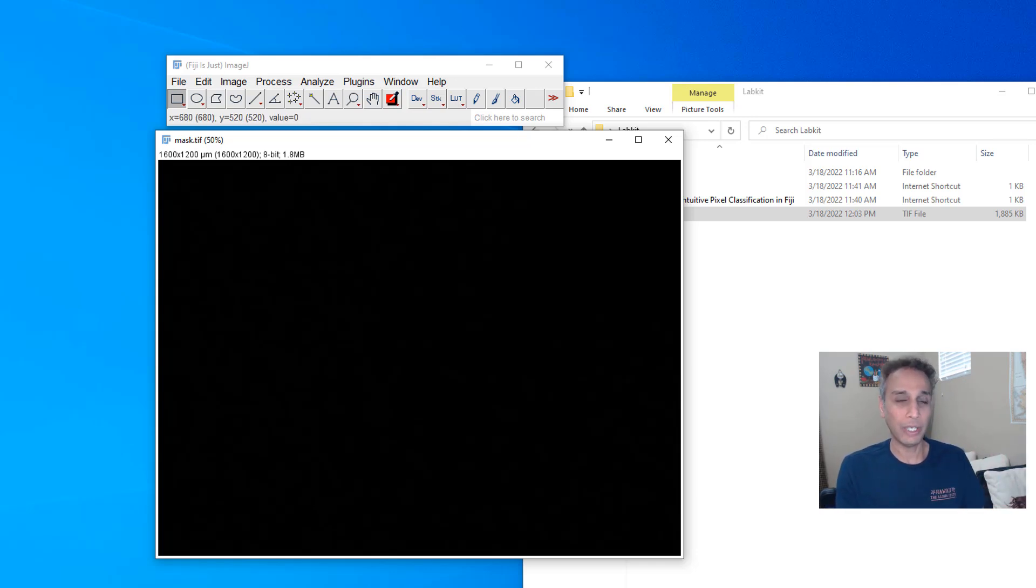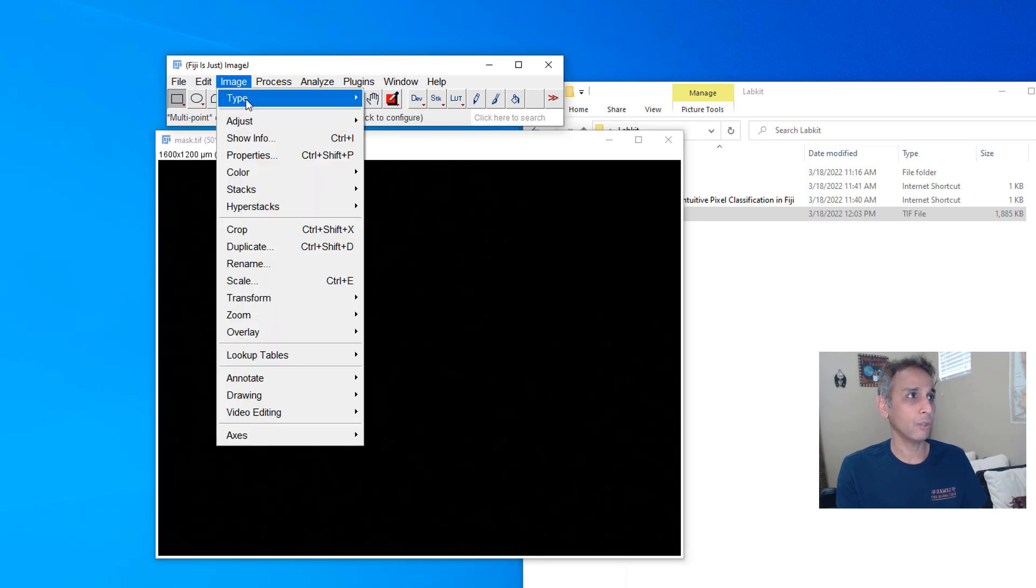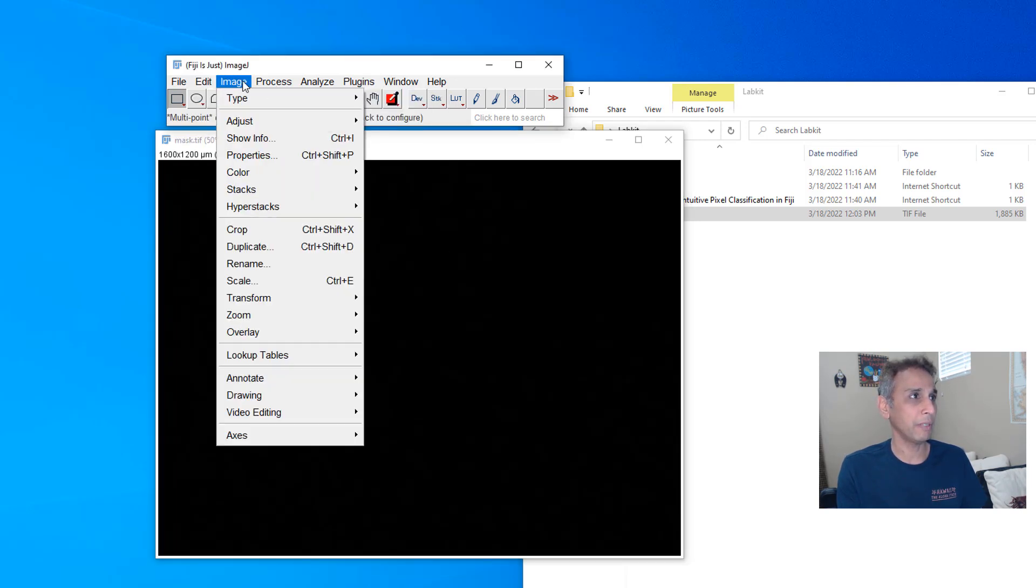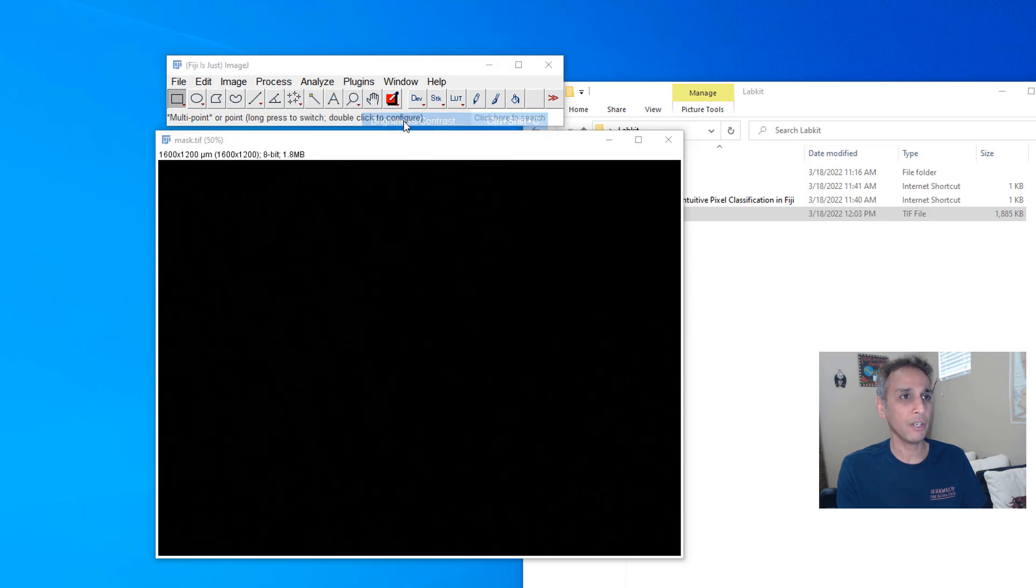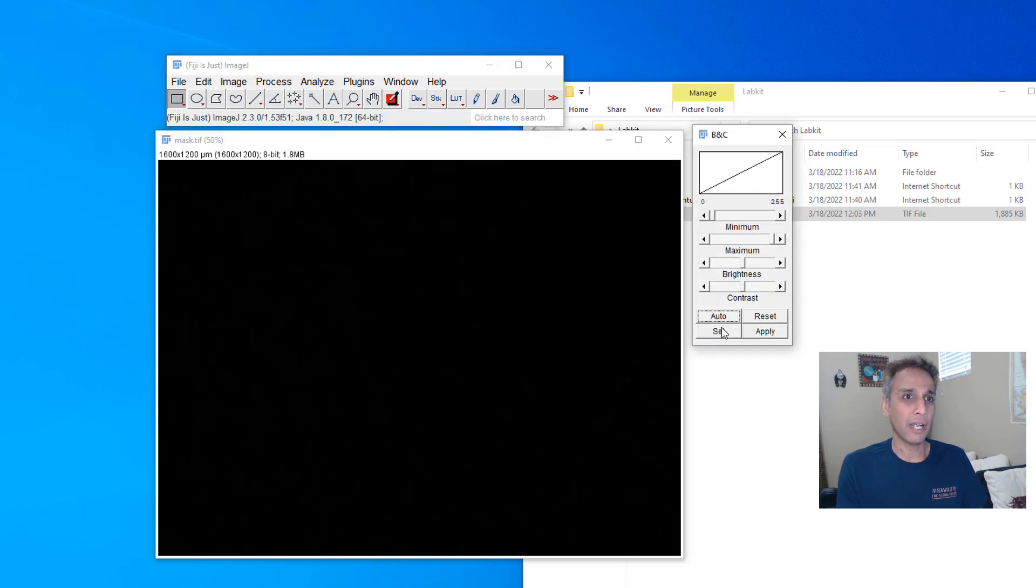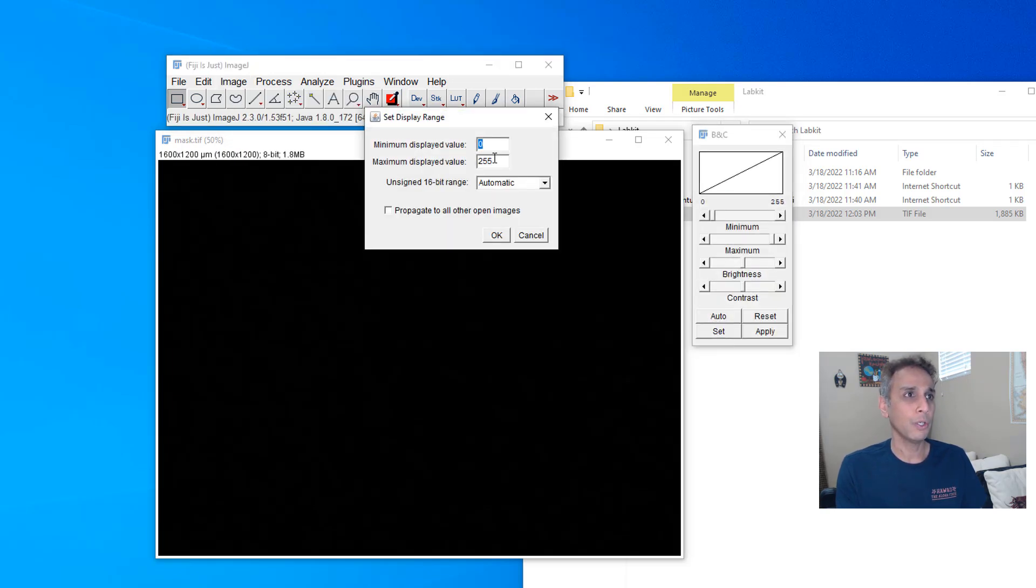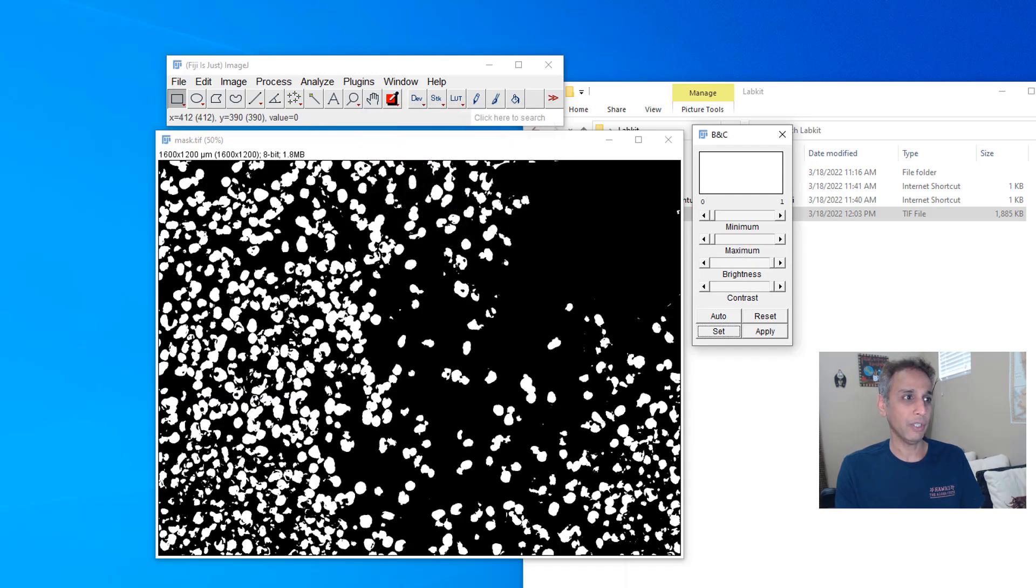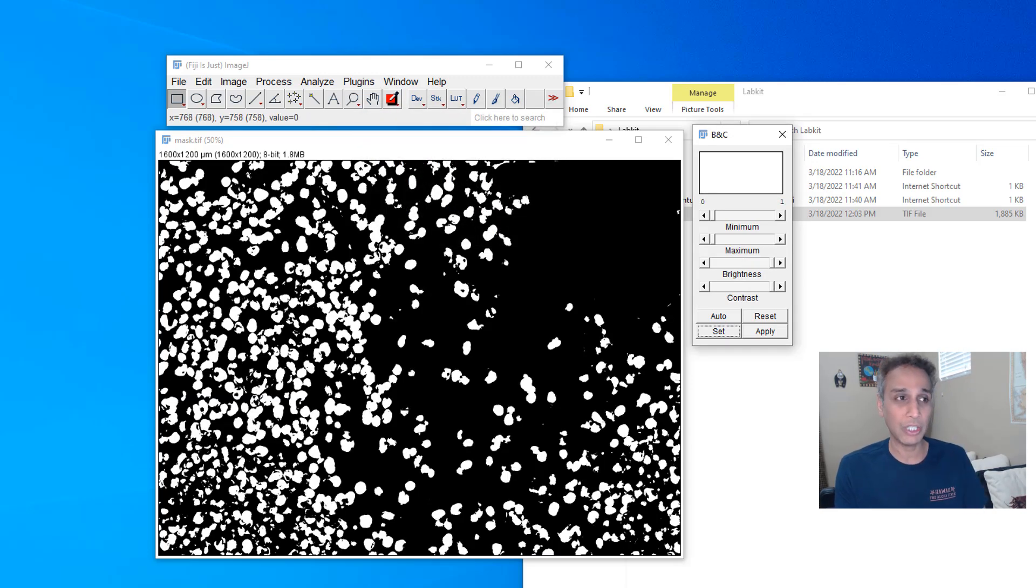So you need to adjust the brightness contrast to see exactly where your pixels are. So let's go to let's go to image. Where is it? Adjust brightness contrast. And now let me just set it to zero to one. And when you do that, there you go. You should see all the labeled regions.